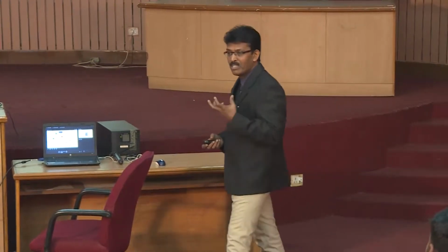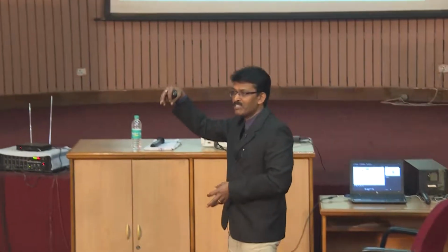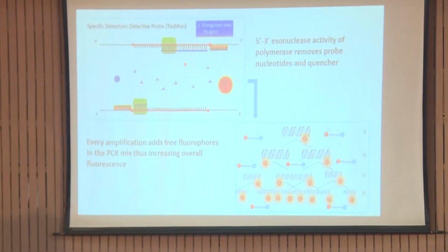And the intensity of the fluorescent signal is captured by a spectrofluorometer. Remember, there should not be confusion about whether it is SYBR Green based or probe based. The machine is the same. There is no separate machine for probe based real-time PCR, because there is only one extra component sitting on top and monitoring what is going on.